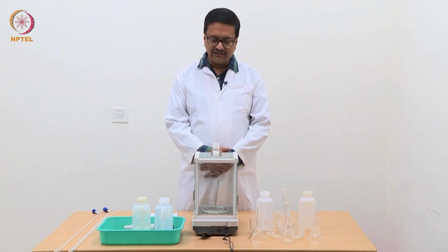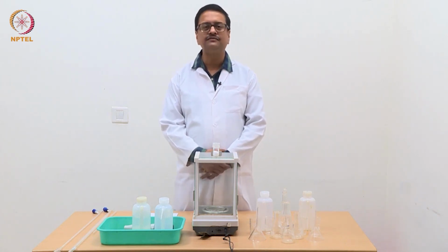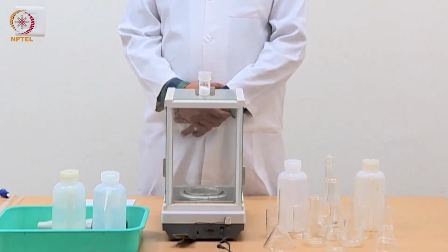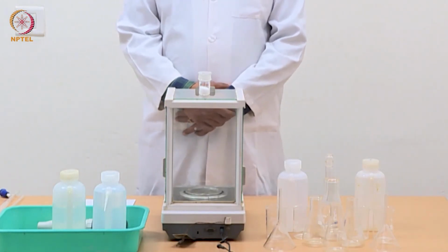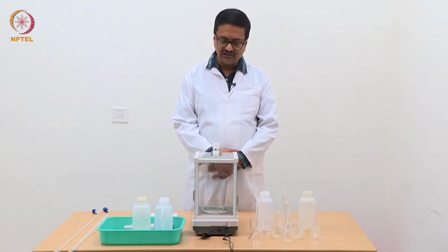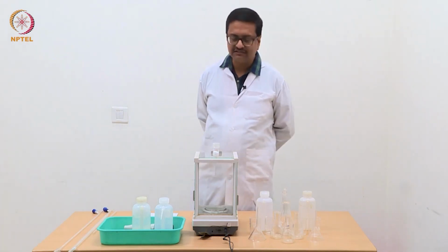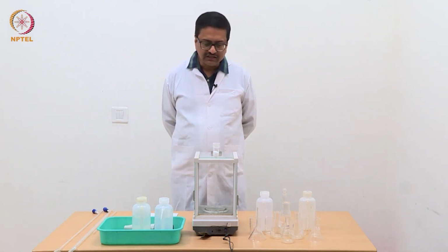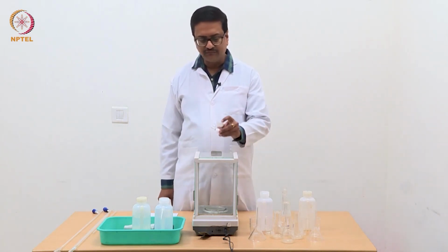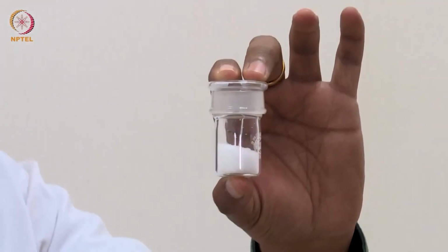A primary standard is a compound which can be used for a long period of time in solution, and the strength of that solution does not change over a period of time. The compound is very stable in solution and does not decompose easily. So, for acid based titrations we normally use oxalic acid dihydrate, which is here in this bottle.